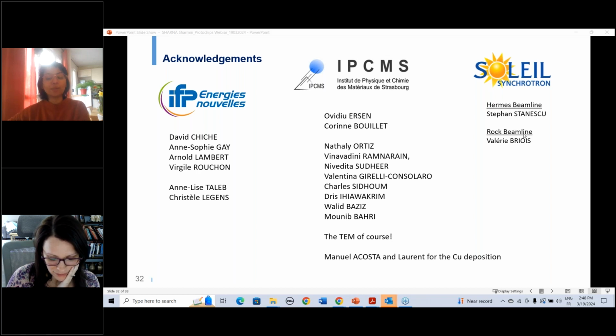Like for our case, we did SEM, we did XRD, we even did in situ XRD to be sure to know what we expect. And a combination of techniques has allowed us to already have a very good understanding of the material, and then to understand the nanoscale evolution, go for the TEM.